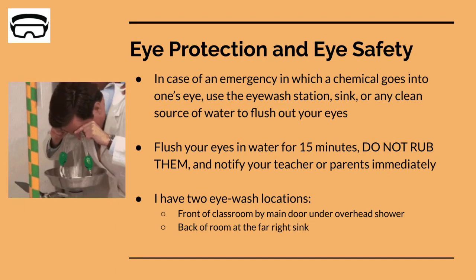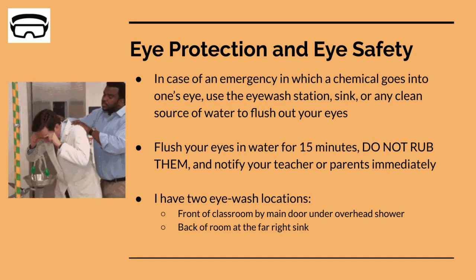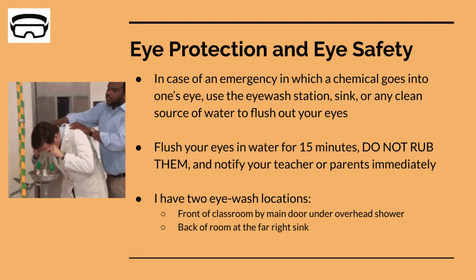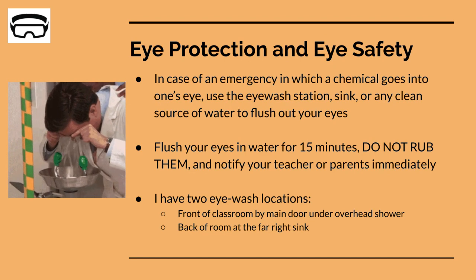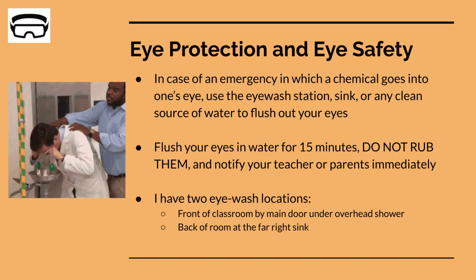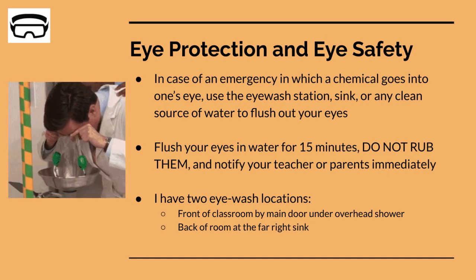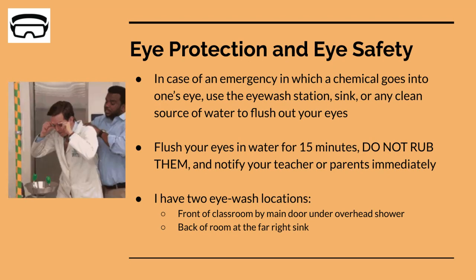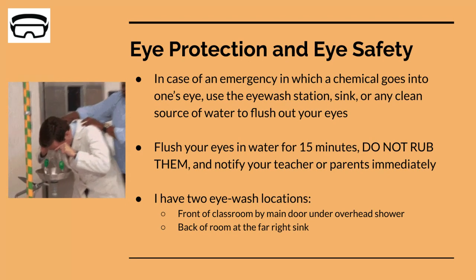When you are using these, you need to flush out your eyes for about 15 minutes and try not to rub them. If something gets in your eyes, it's going to be super hard not to rub them, but it's all part of the practice. You cannot rub your eyes, and you've got to let me know. So again, wash them out 15 minutes. Let me know.